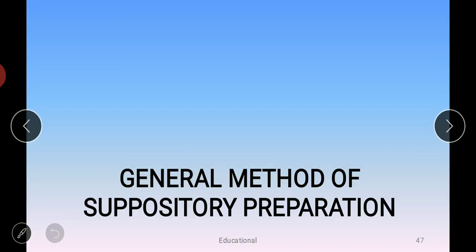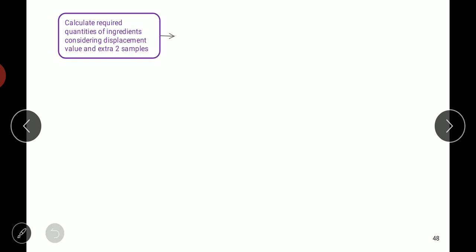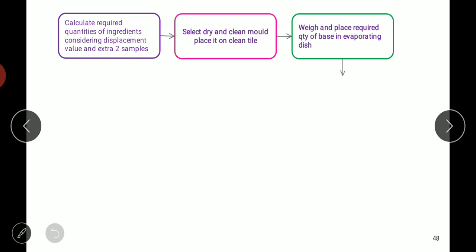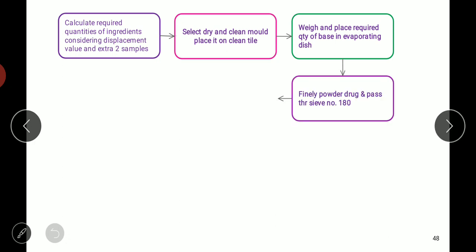In the general method of preparation of suppositories, we first calculate the required quantities of the different ingredients, taking two extra samples so that the final weight is made up. We then select a dry and clean mold and place it on a clean tile. We weigh and place the required quantity of base in an evaporating dish. The finely powdered drug is passed through sieve number 180 or any other suitable sieve to give uniform size particles.